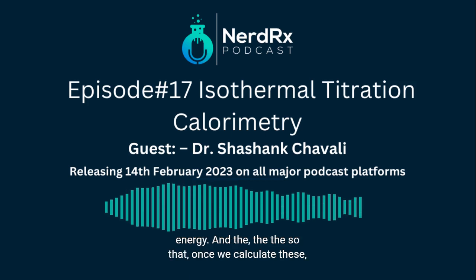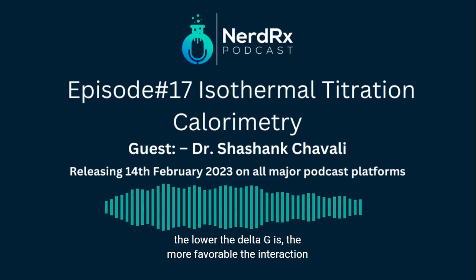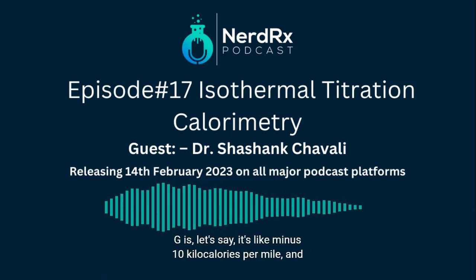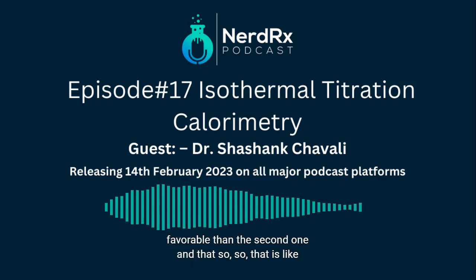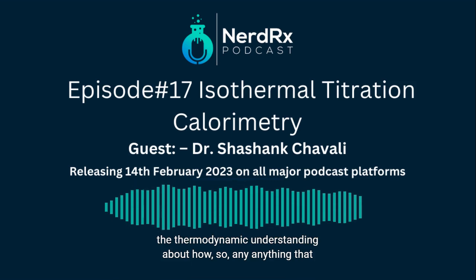Once we calculate these, the lower the delta G is, the more favorable the interaction is. So if we have two interactions, where one delta G is, let's say, minus 10 kilocalorie per mole, and another interaction is minus 5 kilocalorie per mole, the first interaction is more favorable than the second one. That is the thermodynamic understanding.